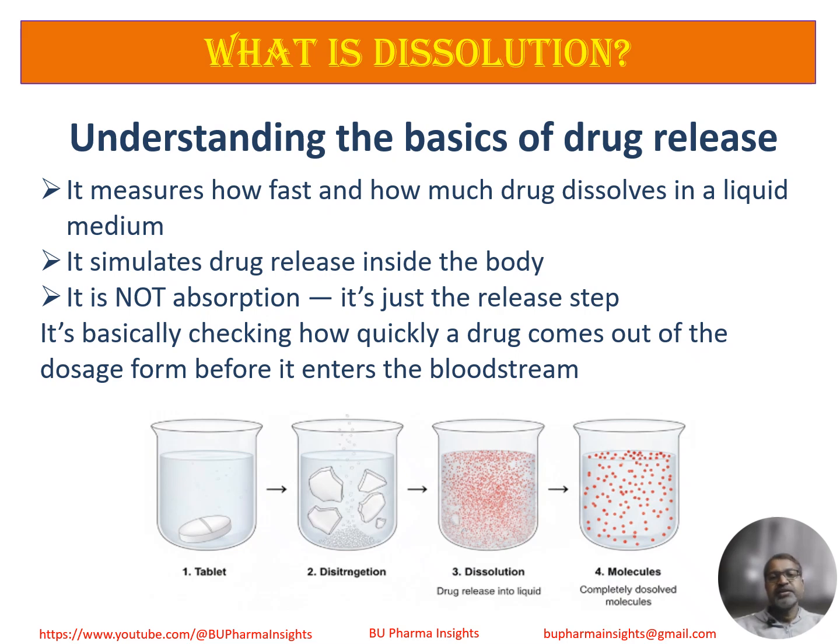Here I am starting a series of 62 videos on the topic Advanced Pharmaceutical Dissolution Science and Application. The first 12 videos are related to core fundamental understanding of pharmaceutical dissolution science. In this video, we will discuss what is dissolution.